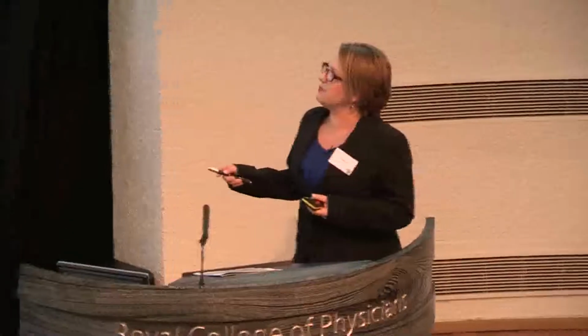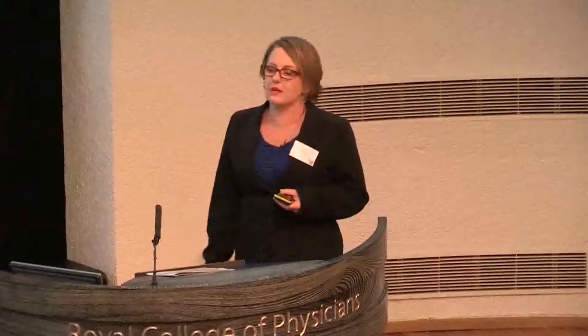Most people have been really interested in what their tap water is like, so we do tend to give them the results. And these are some of the results that we've got. So these are the free-living amoeba, other types of amoeba other than acanthamoeba, and we do tend to get a higher proportion of those. And Simon thinks this is possibly because the environment could sustain acanthamoeba if it was in the system. And these are the acanthamoeba amounts. As I said, the overflow is particularly good at culturing that.